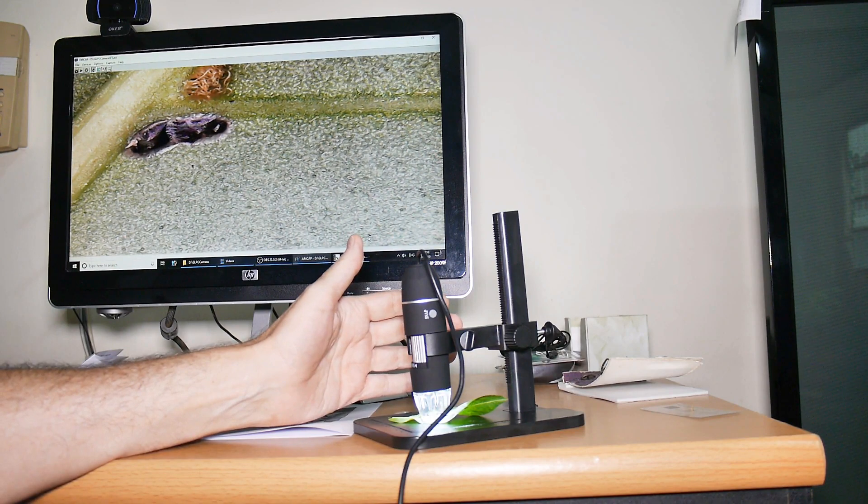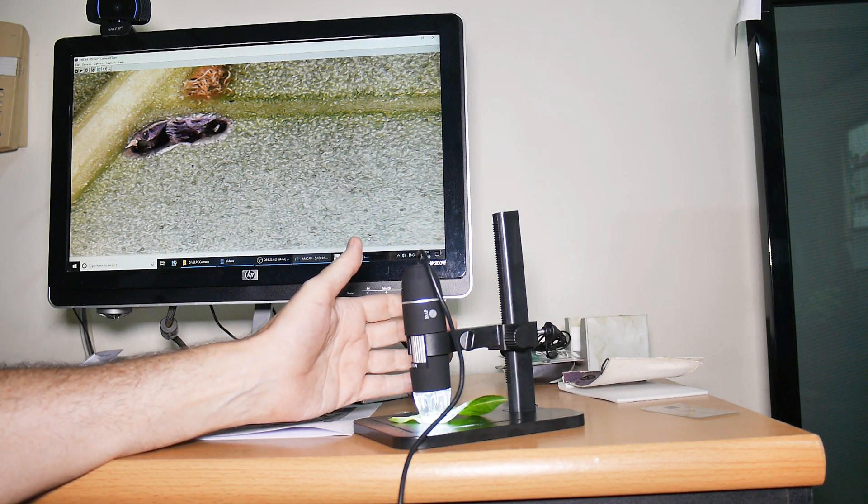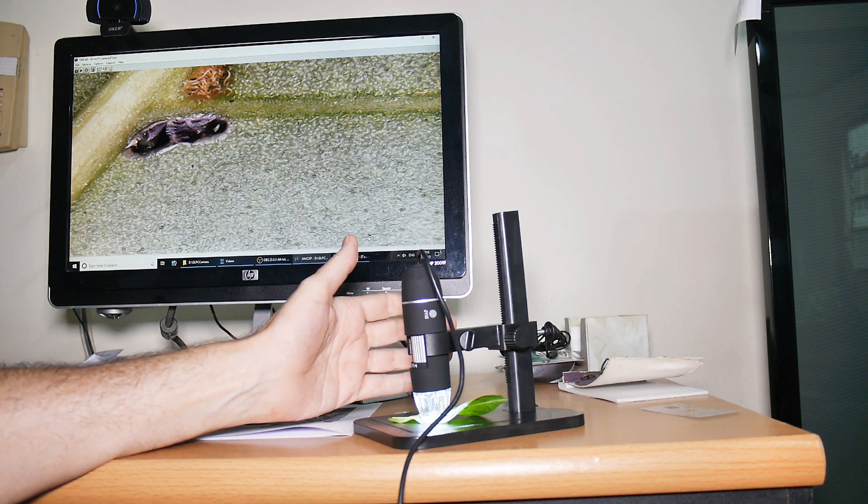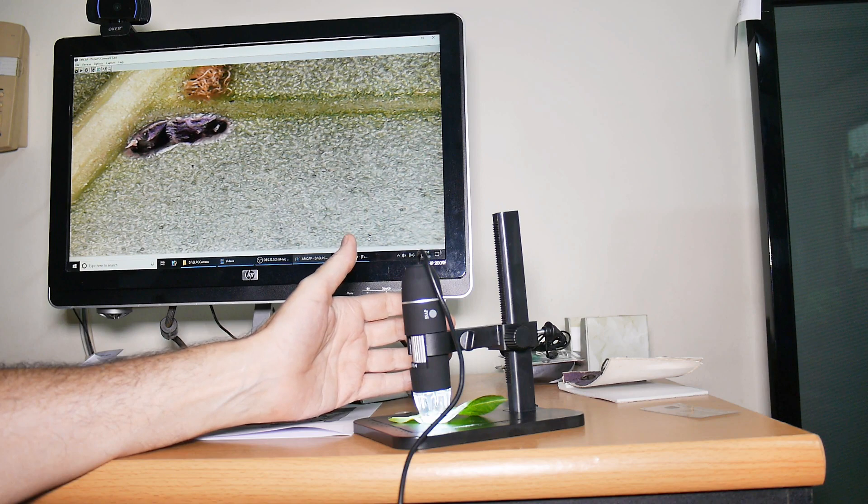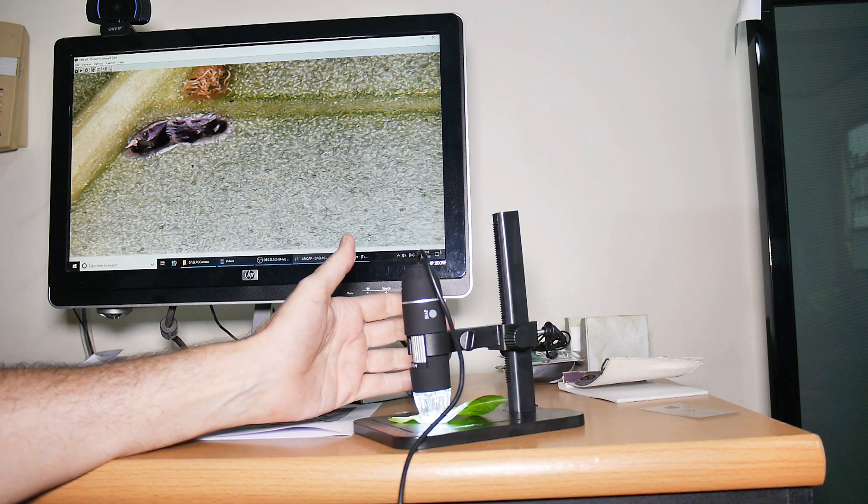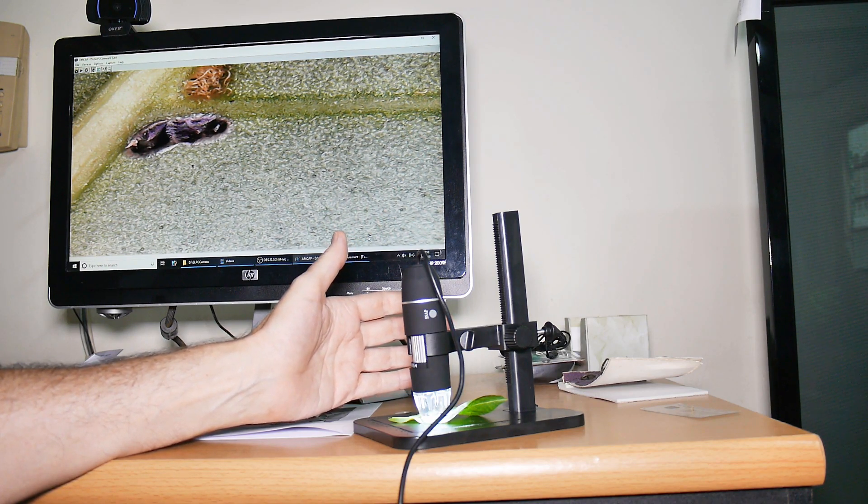Well, that's it for this review of this $10 to $12 digital USB microscope. I hope you found it useful and interesting in your explorations of digital microscopy.